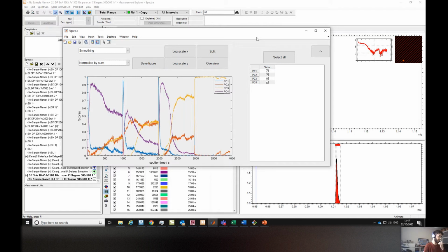Yeah, well, that's interesting because it's kind of a combination, right? Because you don't necessarily have to profile the standard. You could have just a surface map of the standard and then add this. So definitely it will work. But in Orbi, for example, we don't do the images, we just have the depth profiles, right? So even if you don't etch, as long as you know what you're doing, I could stitch to the end of this data here a data set of a standard, scan by scan.